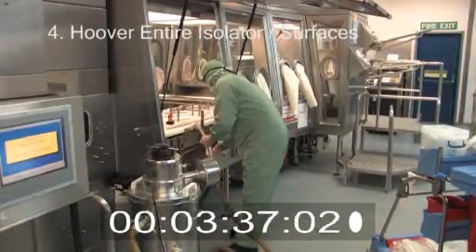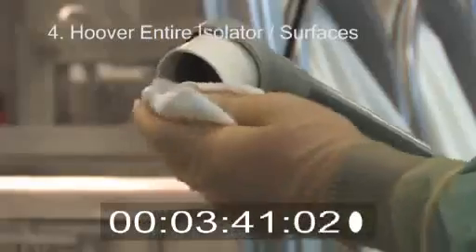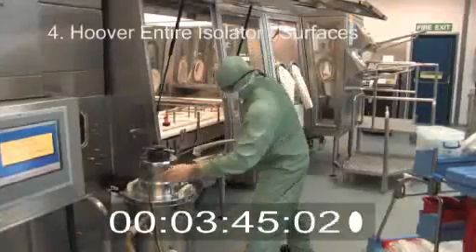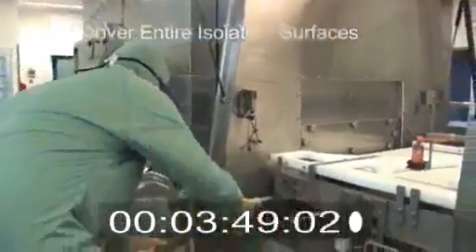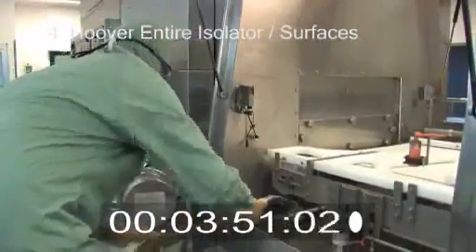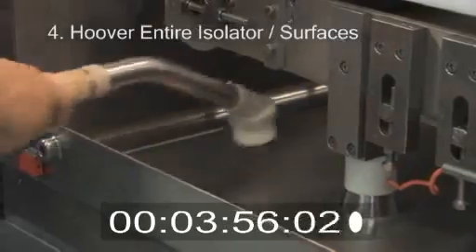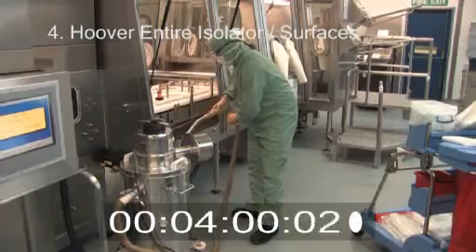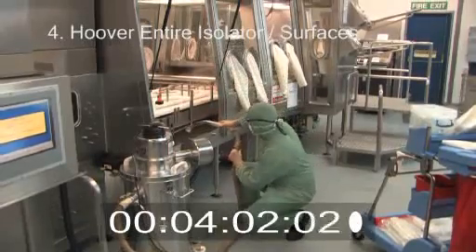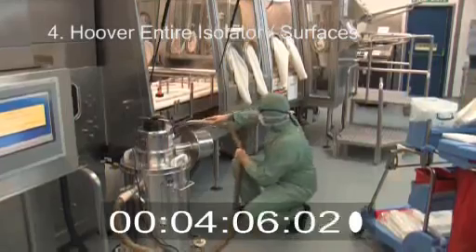Hoover flat surfaces. The hoover, hose, and attachments must be wiped and cleaned before being used. Flat surfaces within the isolator will be hoovered from inside to out. Any areas that are difficult to reach or clean must be highlighted and a suitable tool will be made available.